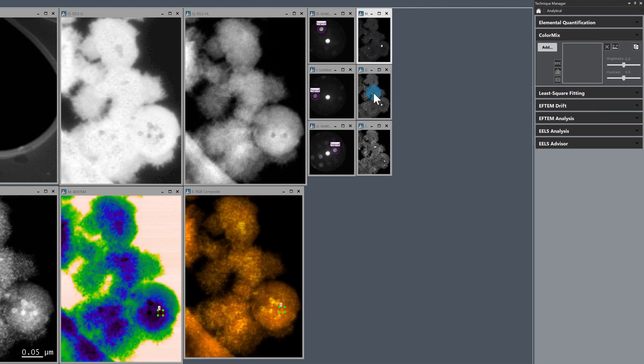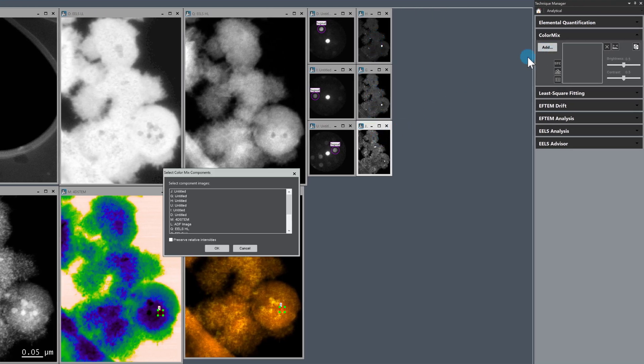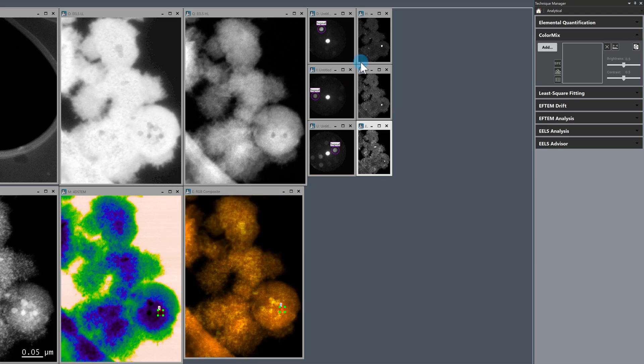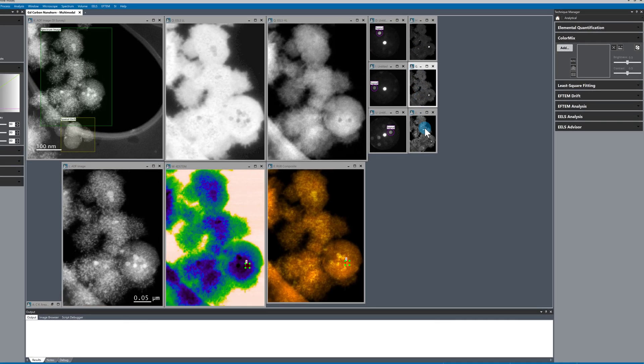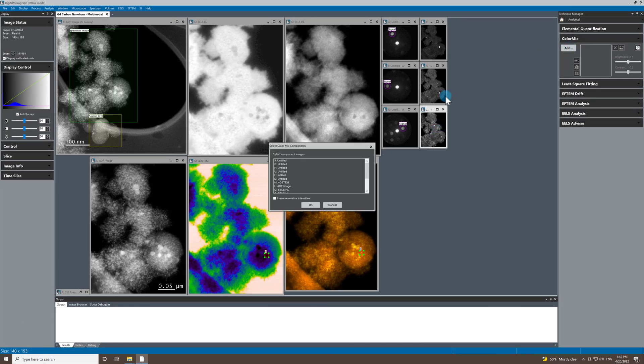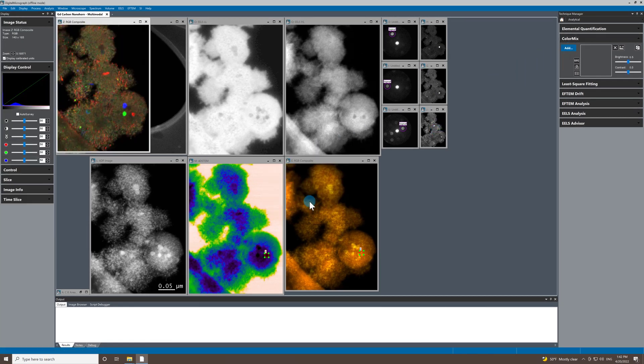So top, middle, bottom. Let's do this one, this one, this one, add, and then go. There we go.